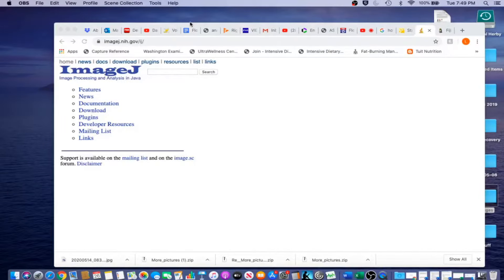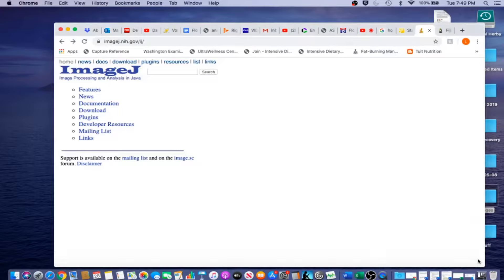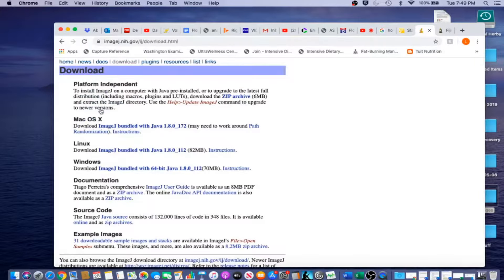The first step is always to download the ImageJ software. In order to do that, you need to go to the ImageJ site, which in this case is imagej.nih.gov. When you are there, click on download and choose the appropriate operating system, which in my case is Mac OS X.